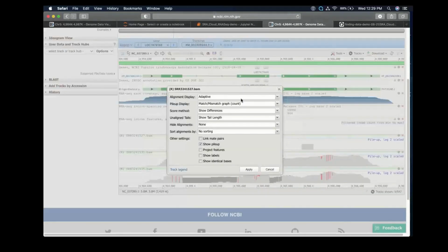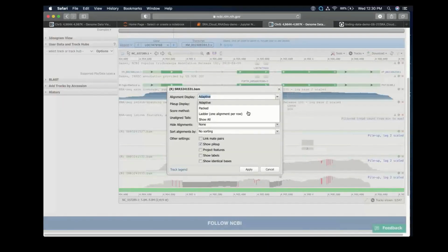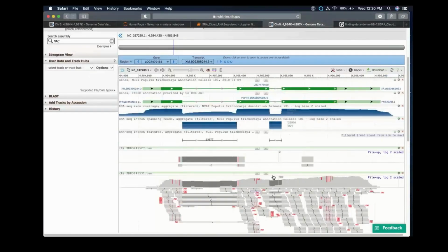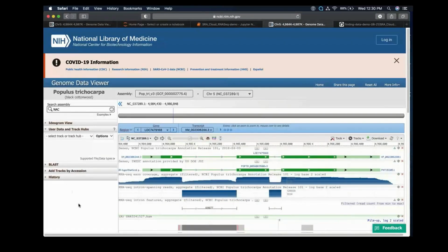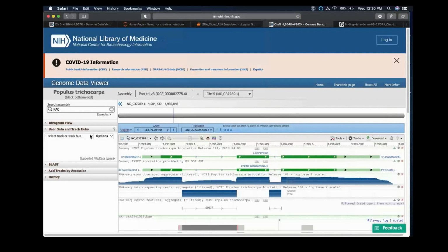If I want to see the tracks, I can just go here from adaptive view to show all. Okay, and there are no tracks for that one, right? It only had 1 or 2, but you'll see here, there's a lot of cool things and features built into Genome Viewer. So we have lots of webinars on those also, so I'm not going to belabor it, but by looking at all the tracks, I can distinguish that there's a lot going on day 5 that wasn't happening on day 0. So that's the beauty of doing an analysis from a notebook and then straight into the viewer. It just saves you time, and then you're not having to download a lot of stuff to your computer directly. You can just stream it all.